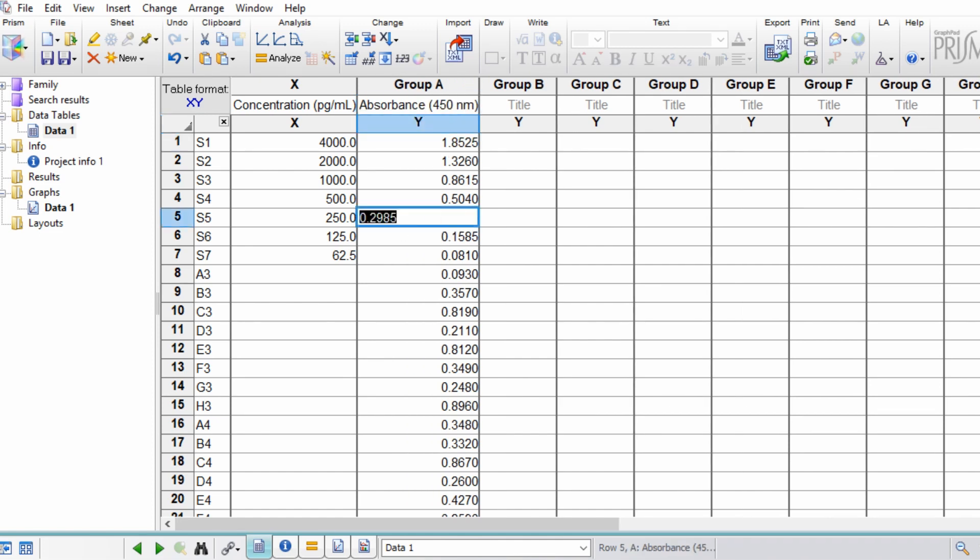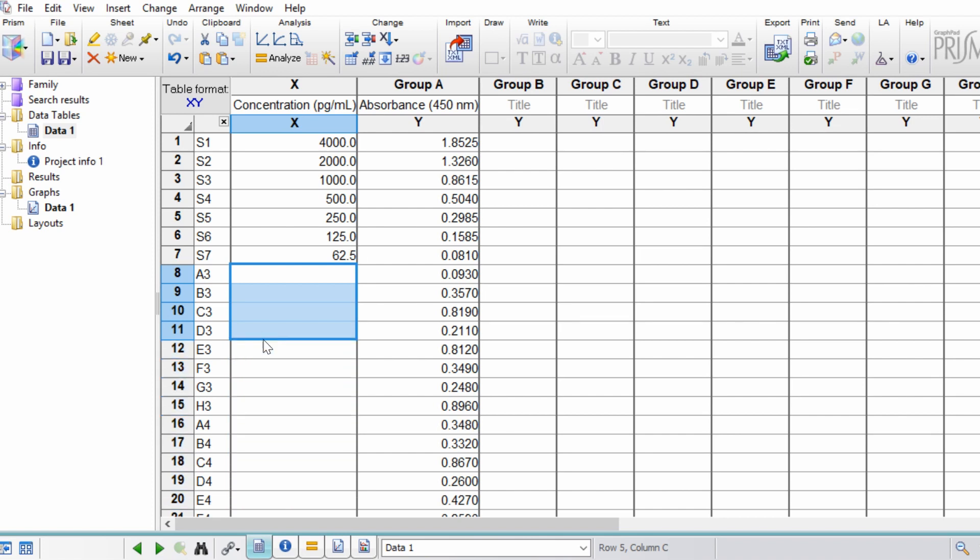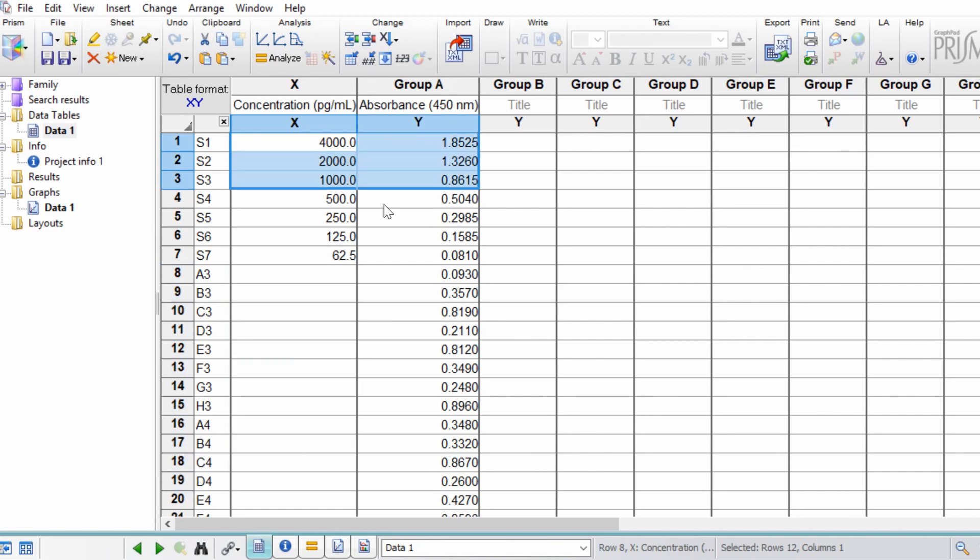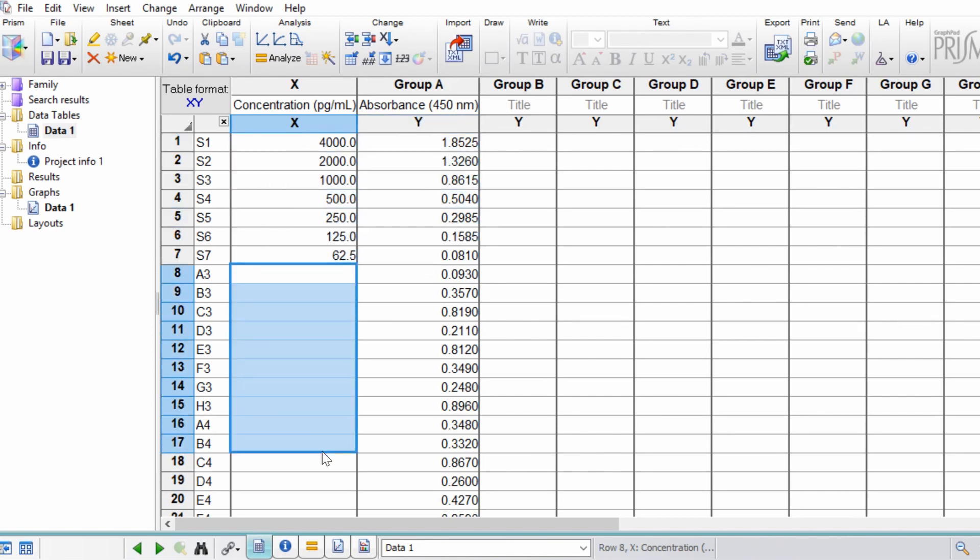Now notice that the samples at the minute don't have any concentrations in them. The aim of this video is to interpolate the standard curve using our known values to get our concentrations for our unknowns, which are these here.